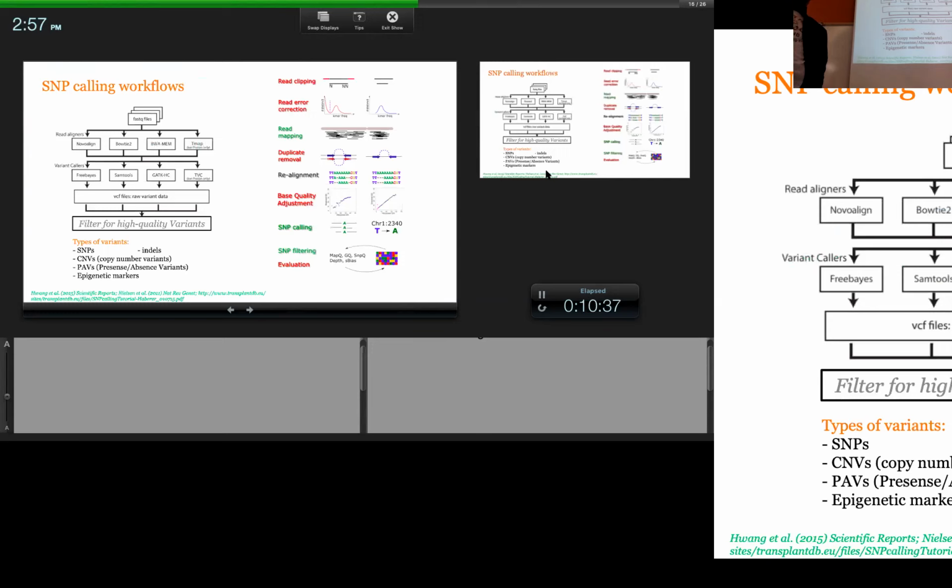Thank you. And what does size selection do? It narrows the size range of your fragments so that they get an equal chance of being amplified, right? If your size range is 1 kb and the lowest is 30 base pair, you're going to be getting so much product or amplicons from your 30 base pair, and you're not going to be amplifying your 1 kb that efficiently, right?